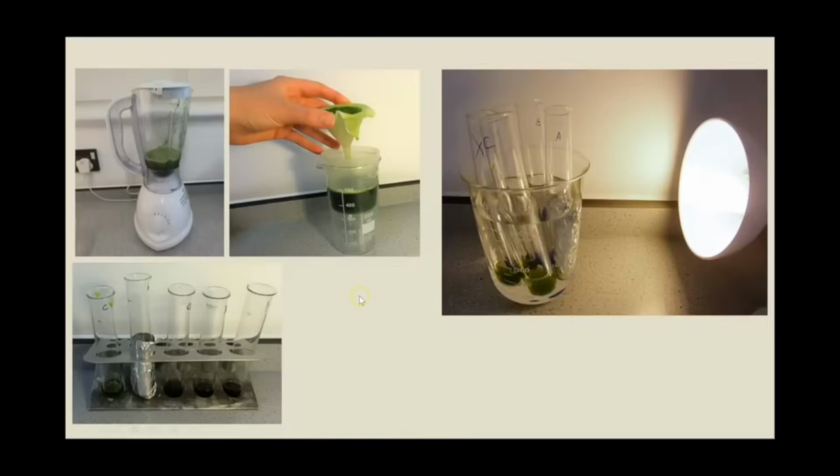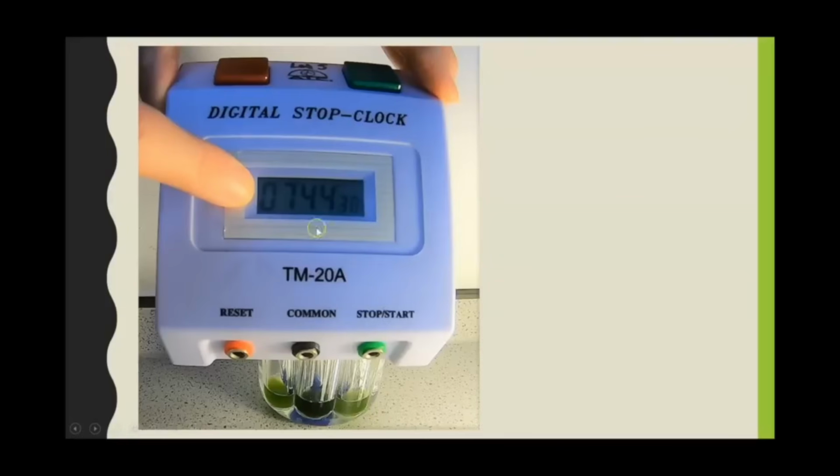And here are the results a bit clearer. The first one, I said, took 7 minutes 44 seconds, and I'll convert that all into seconds. The actual title of the required practical is investigating the effect on the rate of reaction. And this is just the time taken. To convert it into rate of reaction, you can do 1 divided by the time taken.